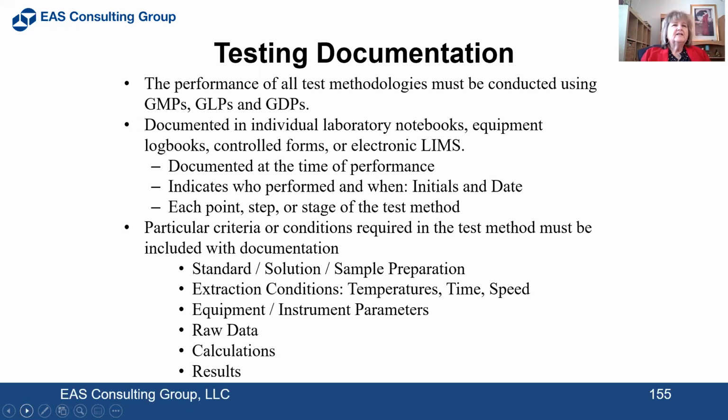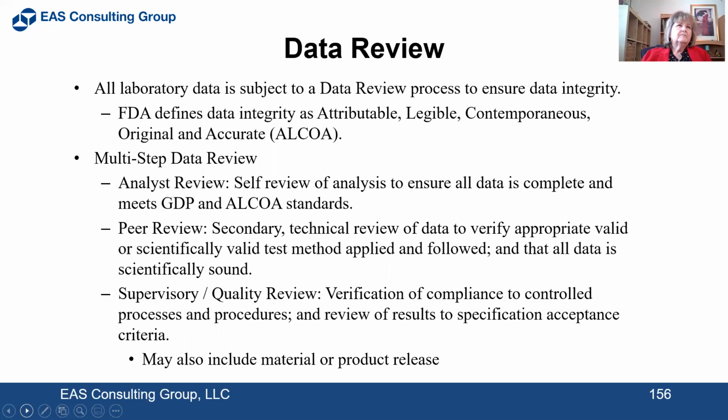Particular criteria or conditions that are required in the test method must be included with the documentation. So that's going to cover your standard, your solution, your sample preparation. It's going to include your extraction conditions, any temperatures, times, or speeds that were used, your equipment or your instrument parameters, any raw data that was produced, the calculations that you used, and what the results are.